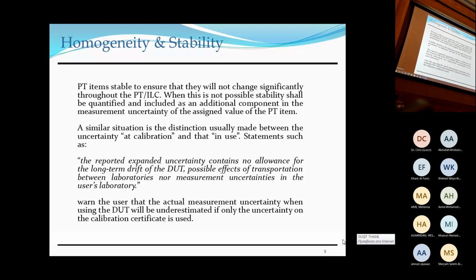In fact, yeah, because you have to take into account the specifics of your lab where the piece of equipment is being used. So this is kind of reminiscent of what I just finished talking about, the stability and the inclusion of a component of uncertainty for the lack of stability in the uncertainty of the proficiency testing scheme.